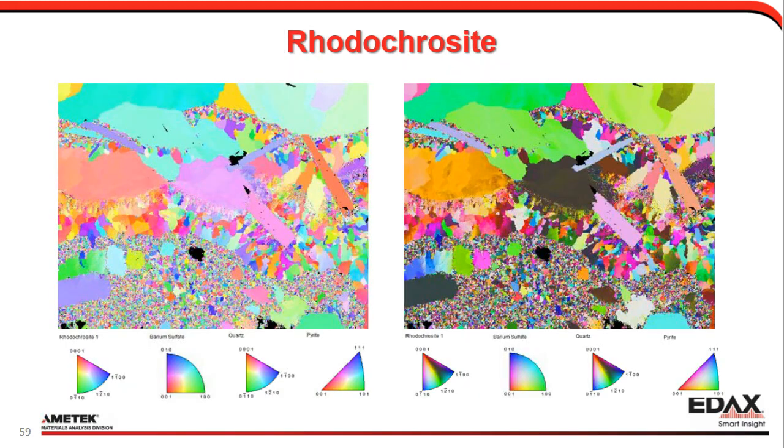Here's an example then where we pull in the black and white, so we have a different way of dealing with the symmetries within the triangles, which is a bit improved, but you can then see the differences there. There are some cases, you'll notice on the red-orange grain, where you see the color variations a little better with the perceptually uniform color map for that color. But then there are others where it's maybe not as clear, especially that really dark one, as you might expect in the middle of the screen there. But it's something to experiment with that I've had some fun with.